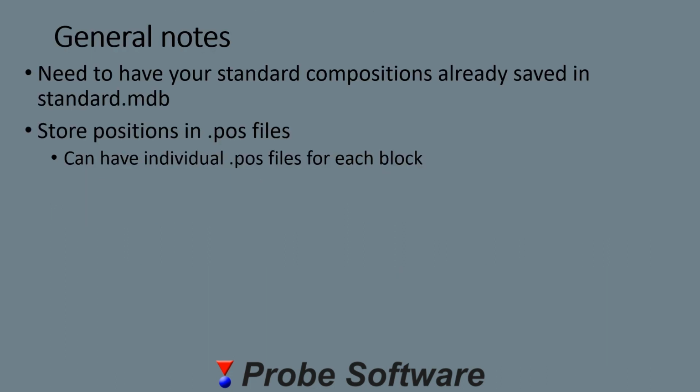Before we store the standard positions, we need to have their compositions already saved in standard.mdb. If you need to find out how to do this, watch the video on standards.